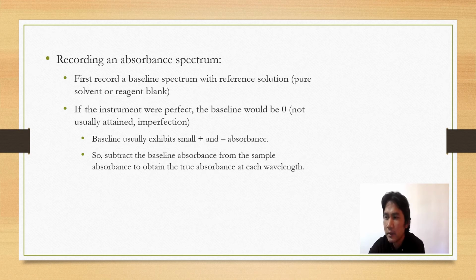But in some spectrophotometers, you don't need to subtract the absorbance of the blank. Okay, the instrument usually adjusts.